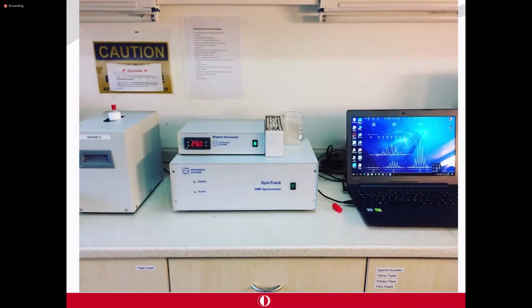This system is a 20.34 megahertz system. It has a 10 millimeter RF coil, so the sample size is lower, but this system has comparably much better magnetic field homogeneity compared to the other systems that I have shown you.